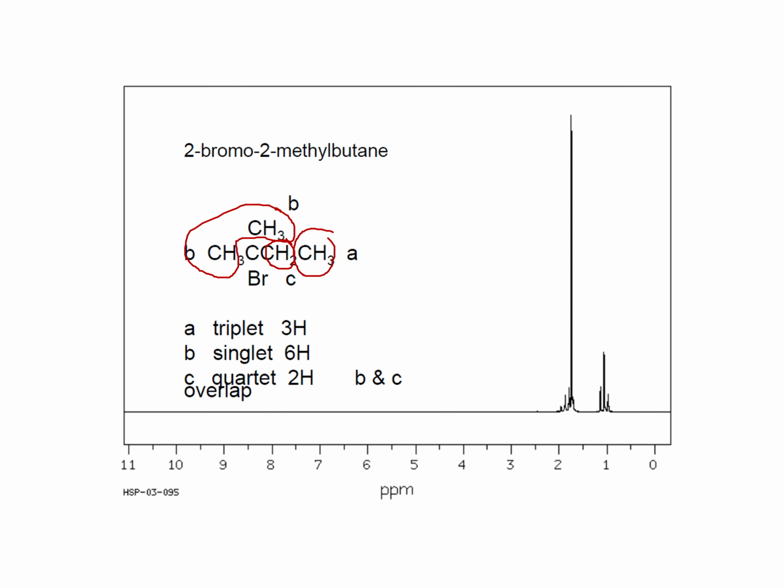So where would their location actually be? Their location would depend on how much they are aligned with one another. So B and C have a similar spectrum. One is a quartet, another is a singlet. Actually, B and C are here.